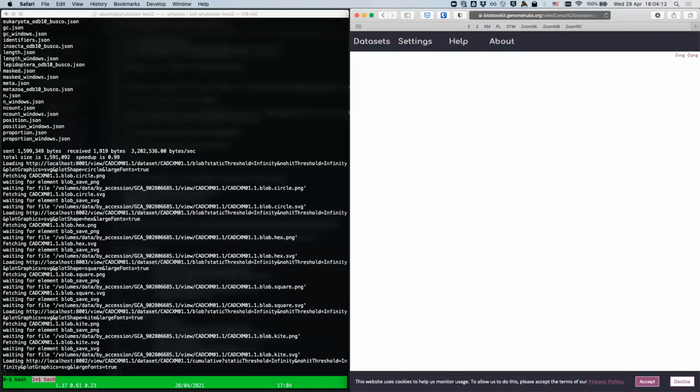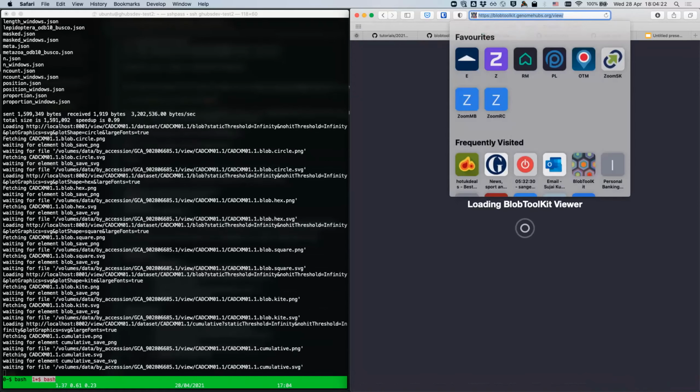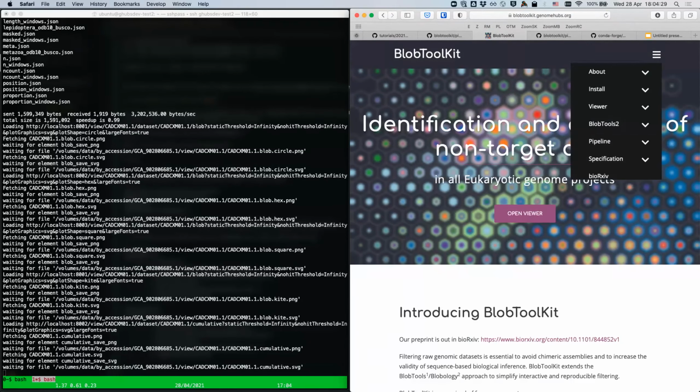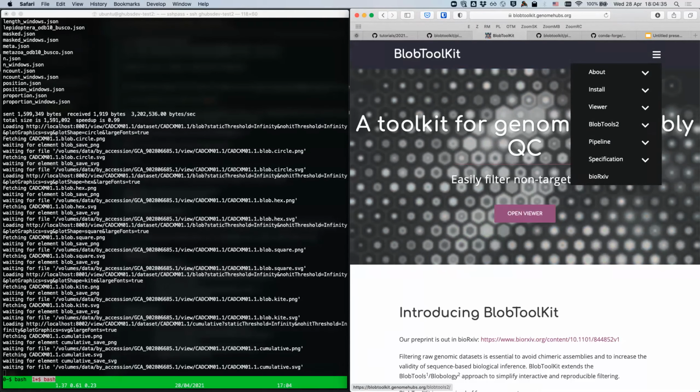Okay, sorry. So to come back to your question, I think the better thing to do is to show you that there are actually tutorial steps for automatic filtering. The problem is that some of these tutorials over here are out of date because they were run for the previous version of the pipeline and tools, but some of them are still useful. I will be updating all of them. I haven't had time. I apologize.